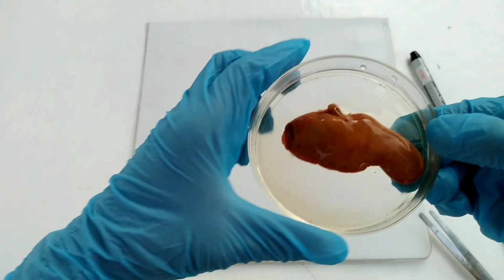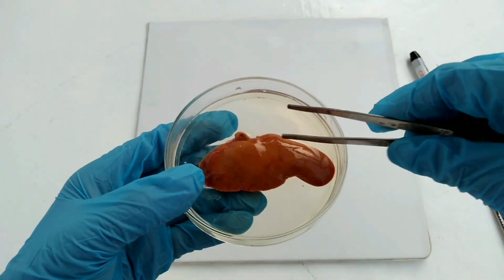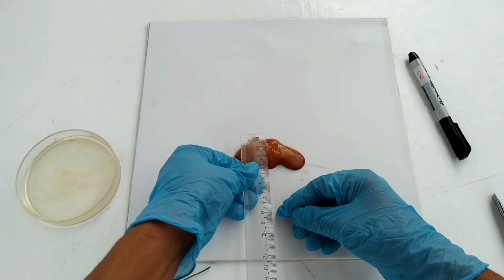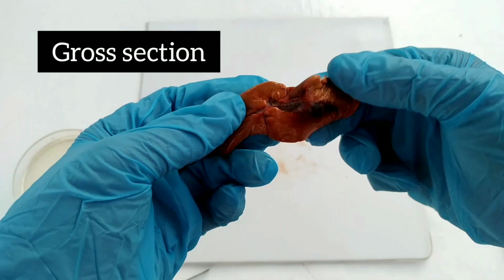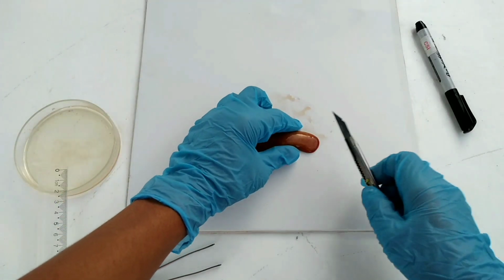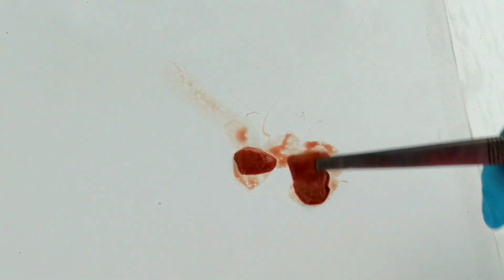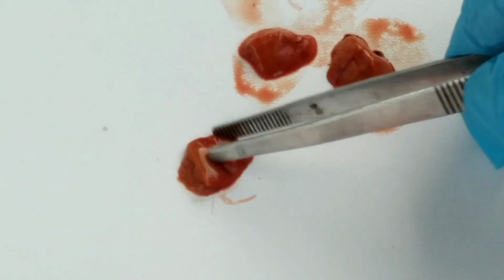This histopathology section is quite different from other sections in the laboratory in terms of the types of specimens received. Most sections may receive only blood and urine specimens. However, in the histopathology laboratory, there is a wide range of specimens, ranging from a very minute biopsy specimen to large organs. Large specimens are dealt with in the laboratory by cutting it into small representatives about 0.5 cubic centimeters in size.